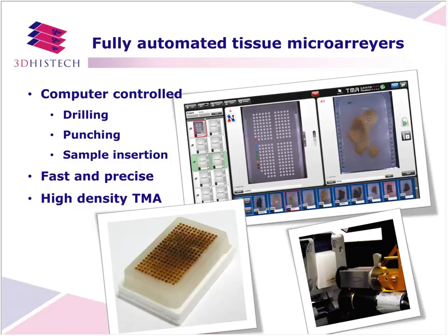Our fully automated tissue microarrayers can make automatically all the important processes, such as the drilling, punching, and sample insertion. In the end, the user will get a high density and high quality TMA.